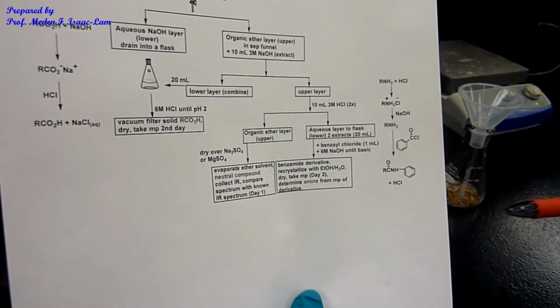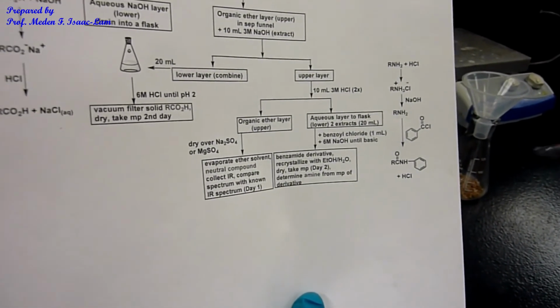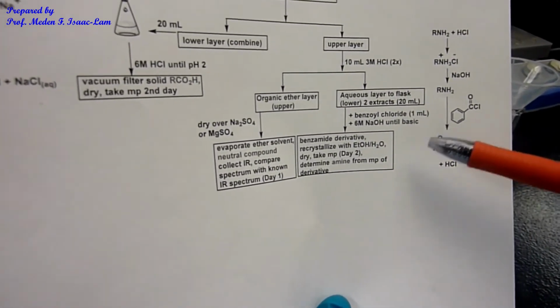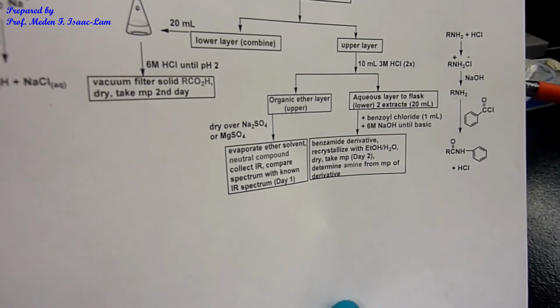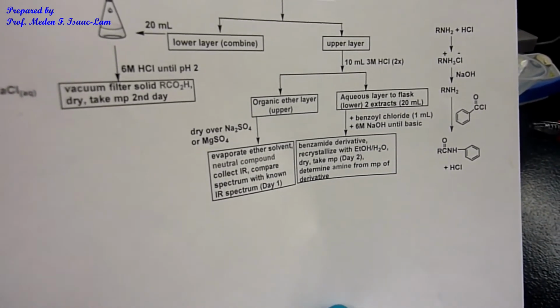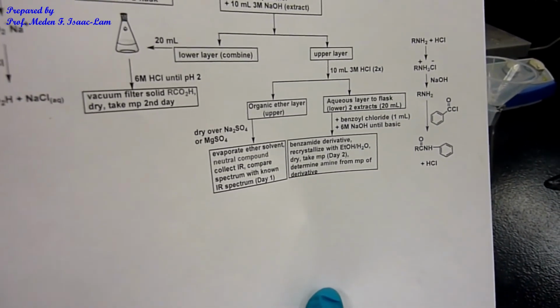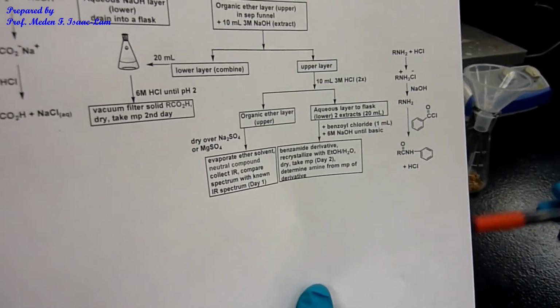So remember, in the first experiment, we only had a single solvent, which is just whatever we chose for part A. But this time, we're doing a mixed solvent system, meaning that we're combining ethanol and water. So when it's indicated ethanol, you use that to dissolve, warm it. It should not be entirely soluble in ethanol, the first solvent. Then when you warm it, you increase the solubility, of course, because you're increasing temperature. And then the second solvent, which is water, should precipitate it out.